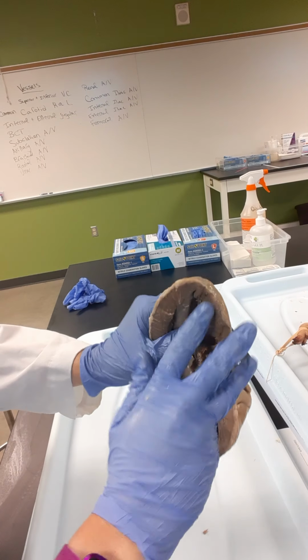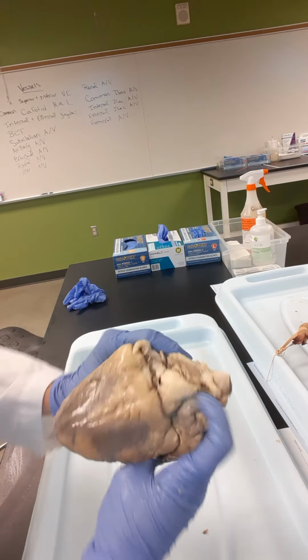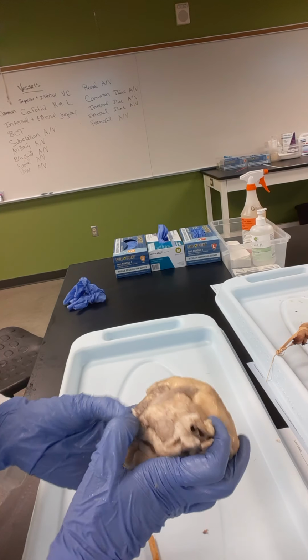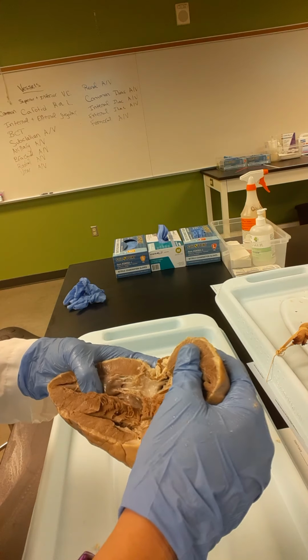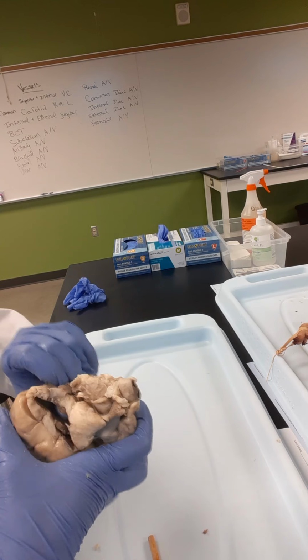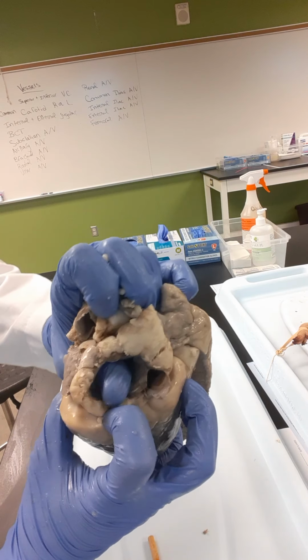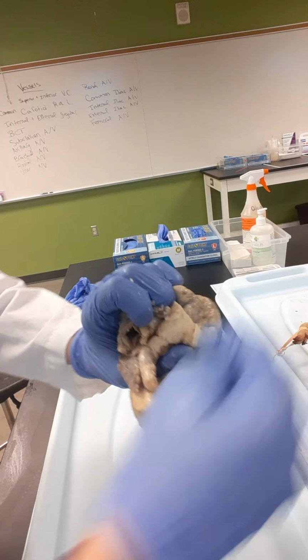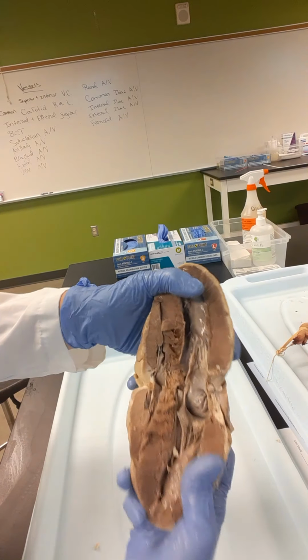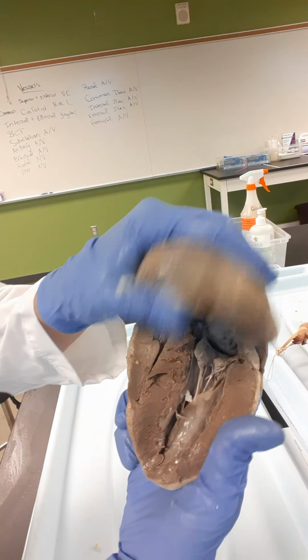Okay? And then if you were curious about the pulmonary veins, those are going to feed in through the left atrium. Pulmonary veins. Let's see if we can find them here. Aha! Okay, pulmonary veins are going to create this little bubble over here. So there's a bubble and we feed in through the pulmonary veins. So I think that's everything. You got it. Good job.